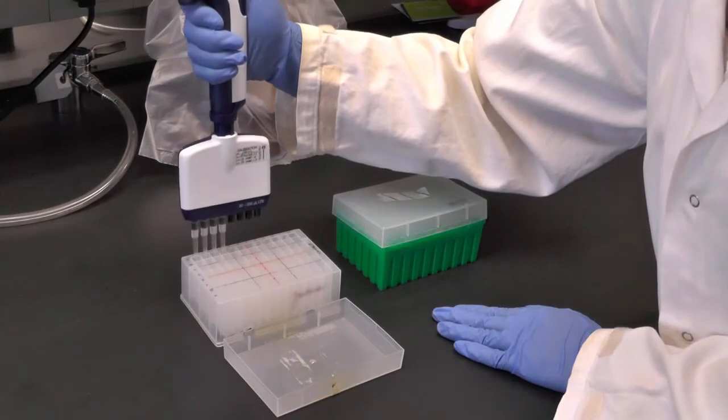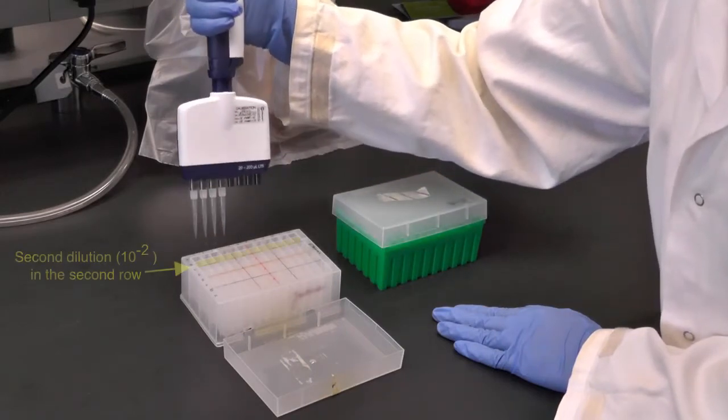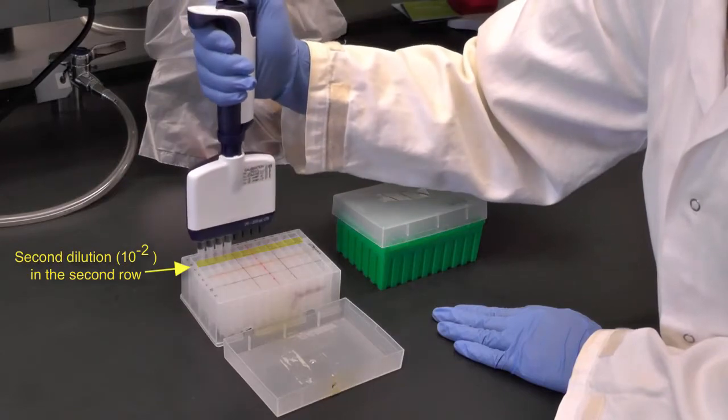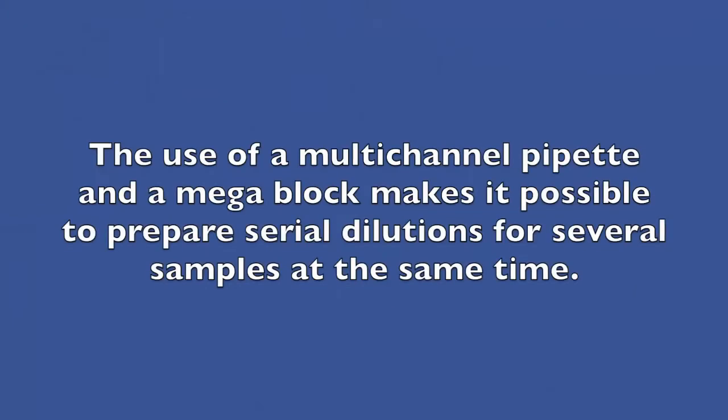Then with empty tips, draw up the amount of solution you need from the first dilution and transfer it into the second row of wells where you want to make the second dilution. Here, the use of a multi-channel pipette and a megablock makes it possible to prepare serial dilutions for several samples at the same time.